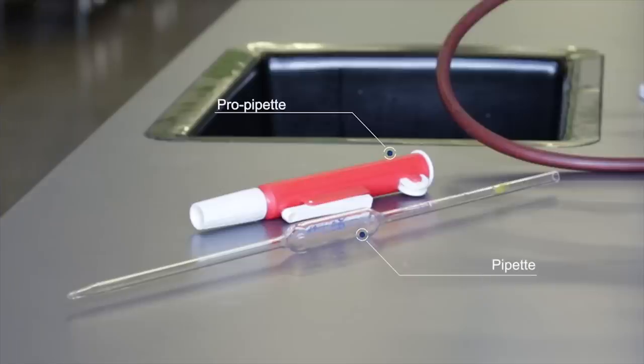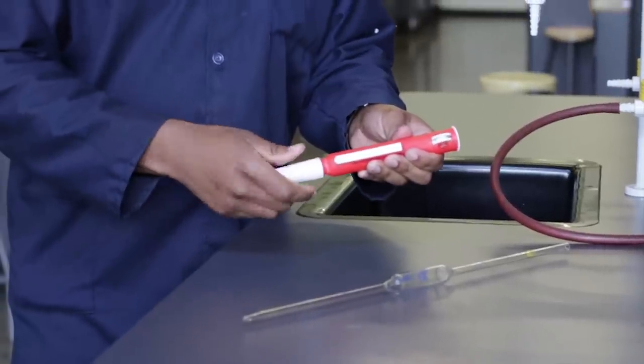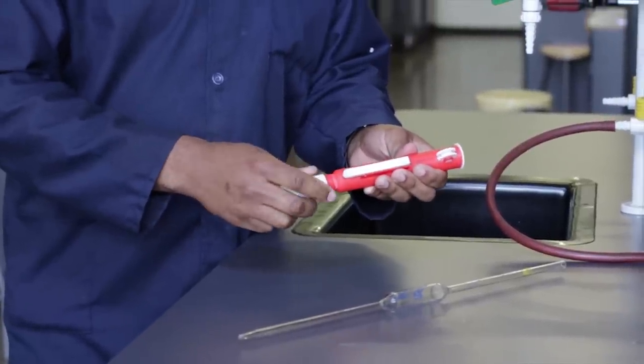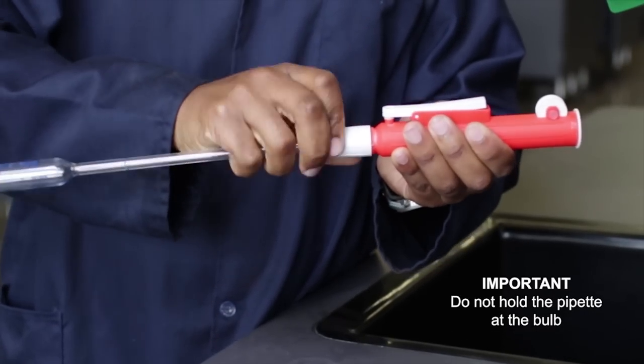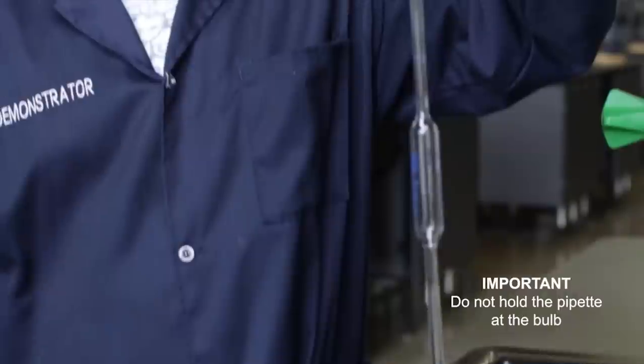The pipette is first fitted with the pro pipette or pipette filler. This is done by loosening the white end of the pro pipette and inserting the pipette into the pro pipette to about 2cm by using a gentle twisting motion and the white end is tightened.